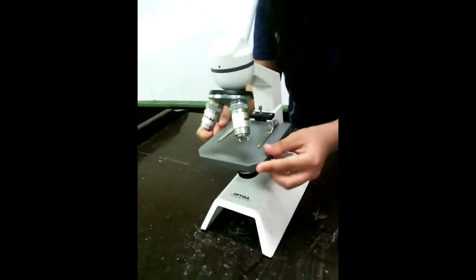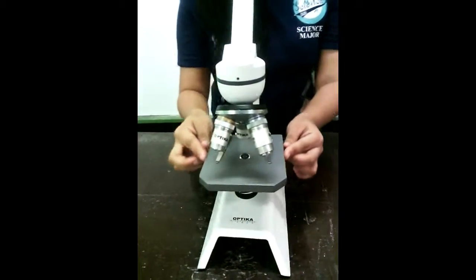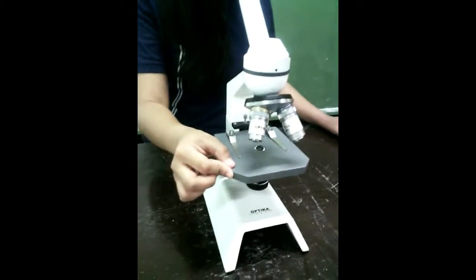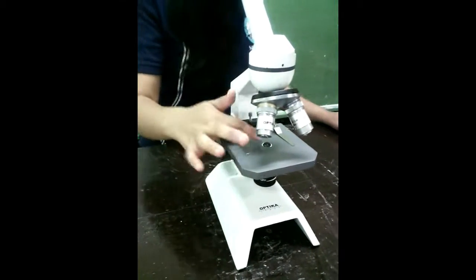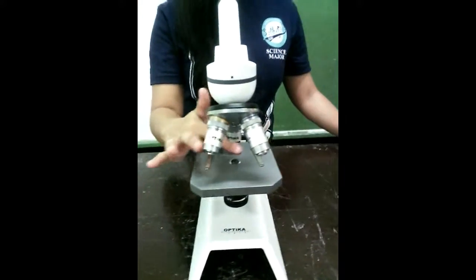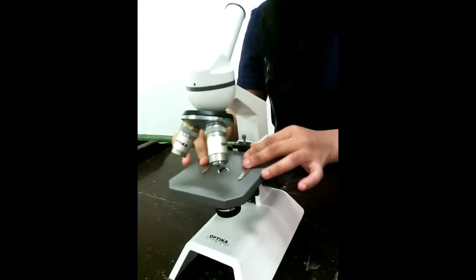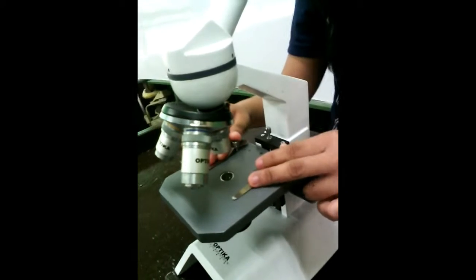The stage is the platform that holds or supports the slide containing the specimen. It has an opening at the center that allows light to pass from below into the specimen for the study. The stage clips hold the specimen firmly on the stage.